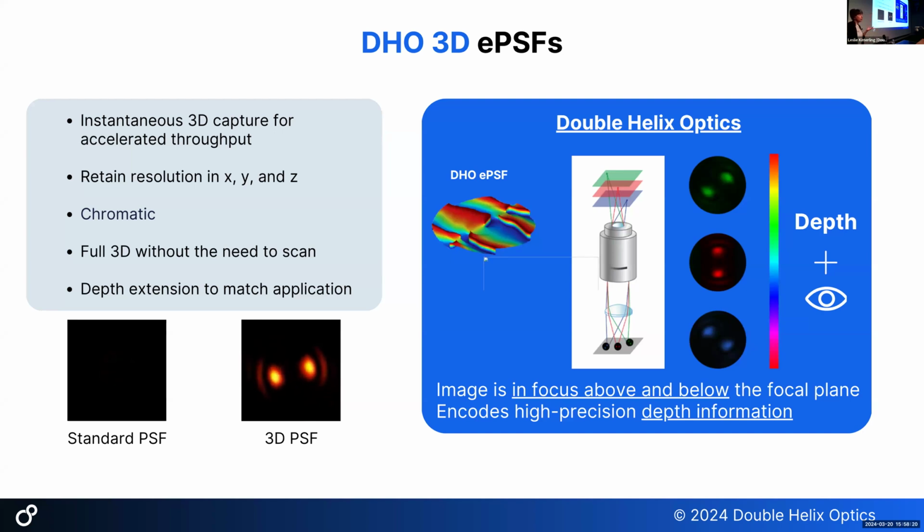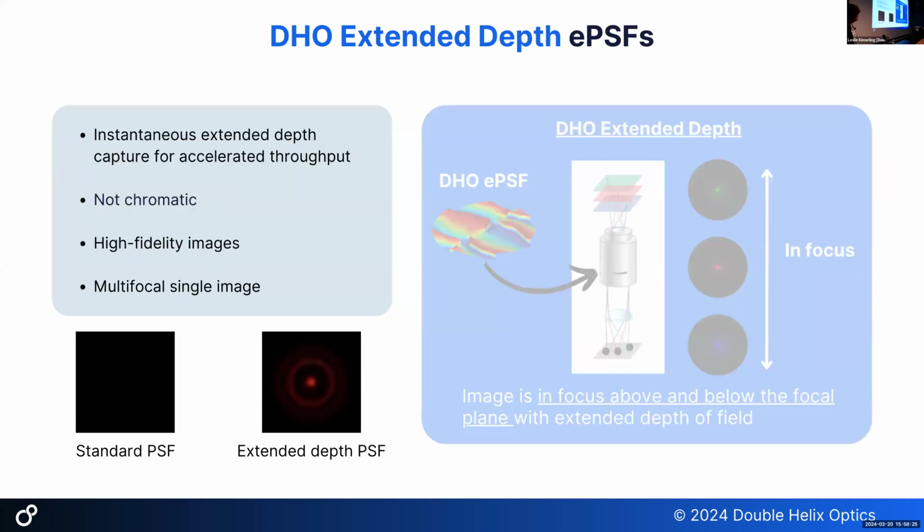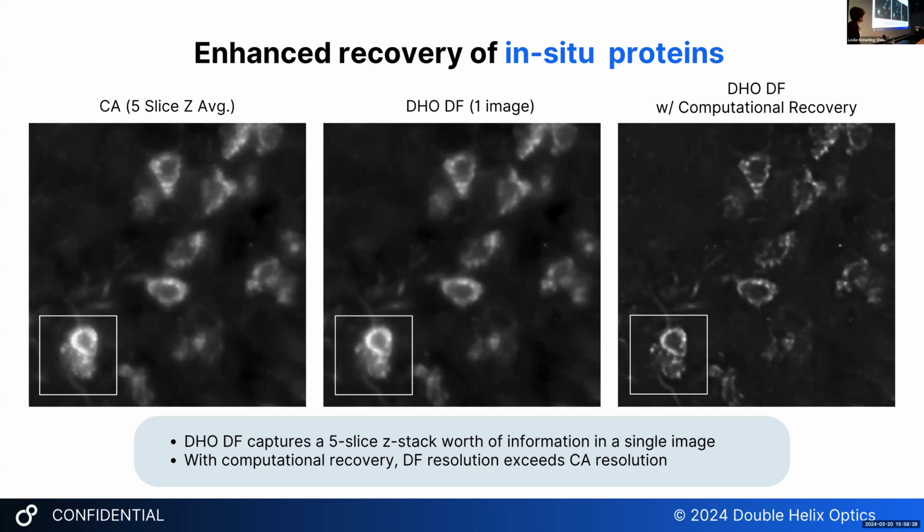If you're doing whole cell and just doing that volumetric, yeah, you can. I think we showed here, this is without deconvolution. This is just native recovery. And the other one to the right is with deconvolution, our form of deconvolution. Again, it depends on how clean and clear you care to have it. What are you looking for in the science? Sometimes it's just, how many can I see? And if I can see them, that's what I care about. Sometimes I want to count them. And how fast do I need to go?